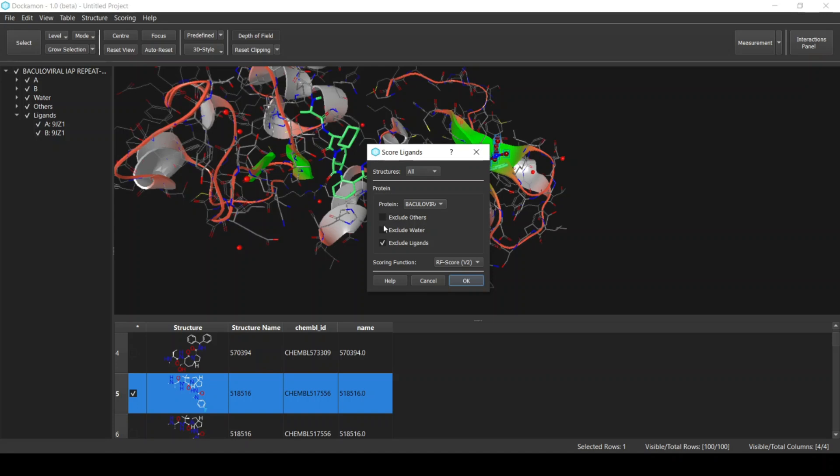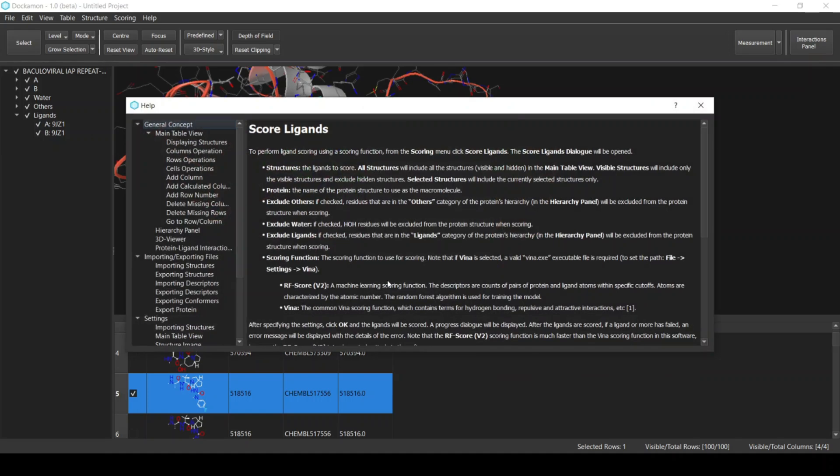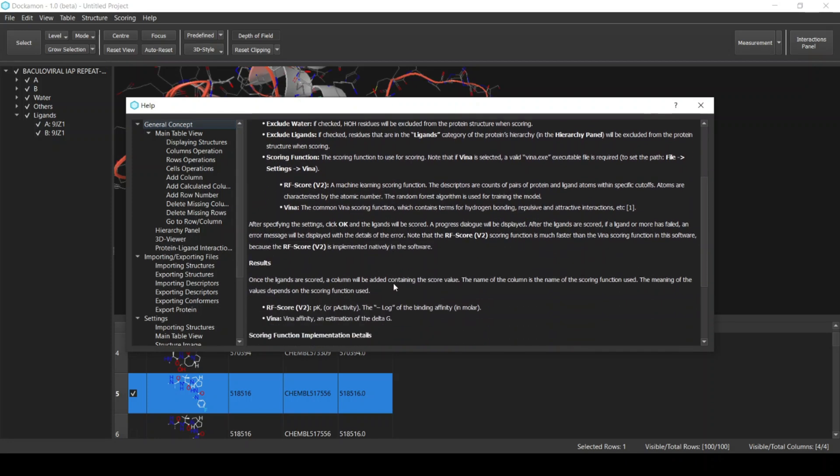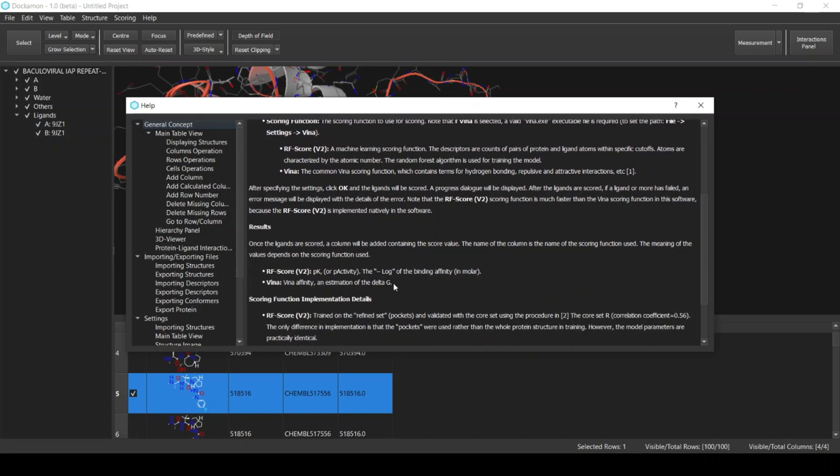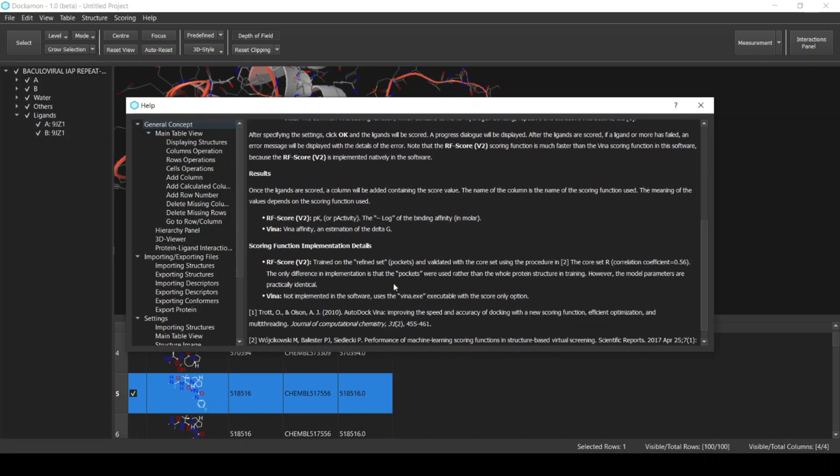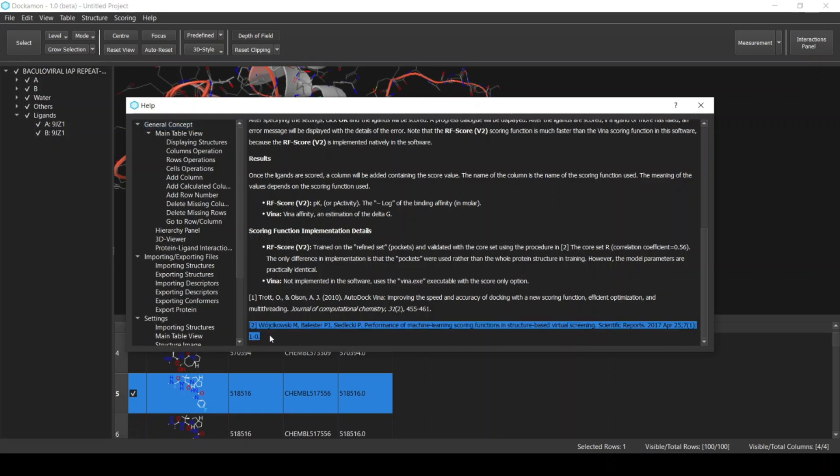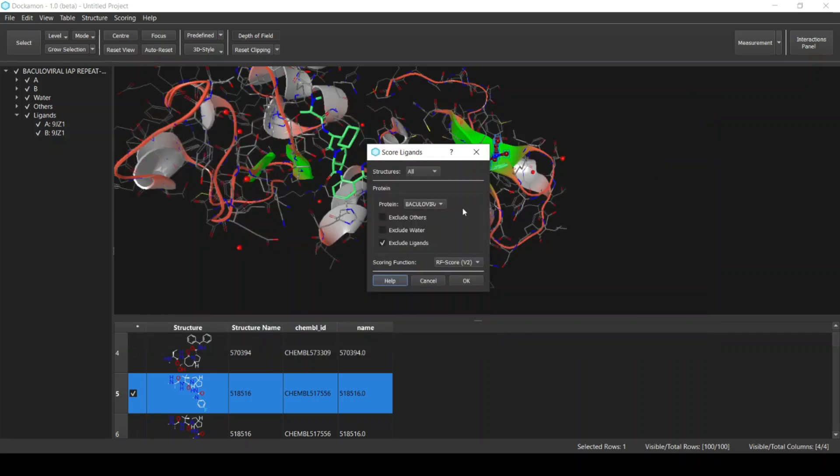Next, as for the scoring function, we will select the RF Score. This is the random forest scoring function, which is a machine learning based scoring function. You can see the details of the scoring function and how it was implemented from the Help dialog. Simply click the Help and you will see the details about the implementation of the scoring function and the results. Basically it's practically the same results as in this publication. Now, after we have selected the options, click OK.